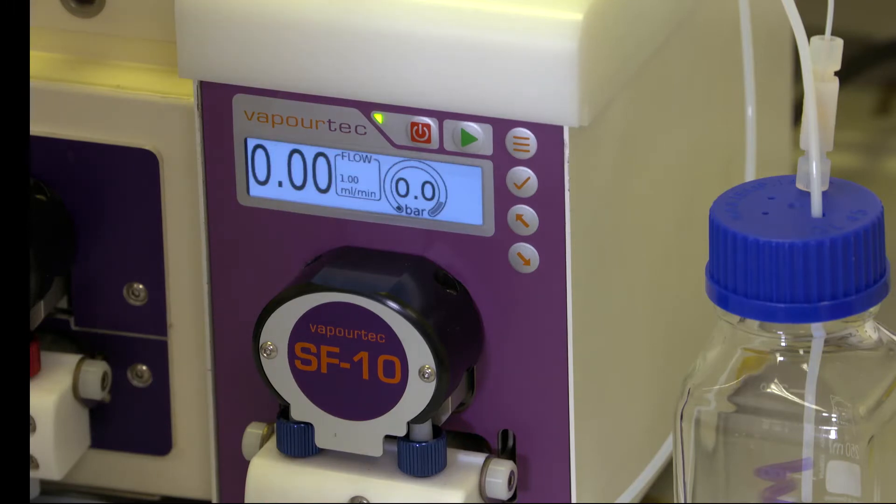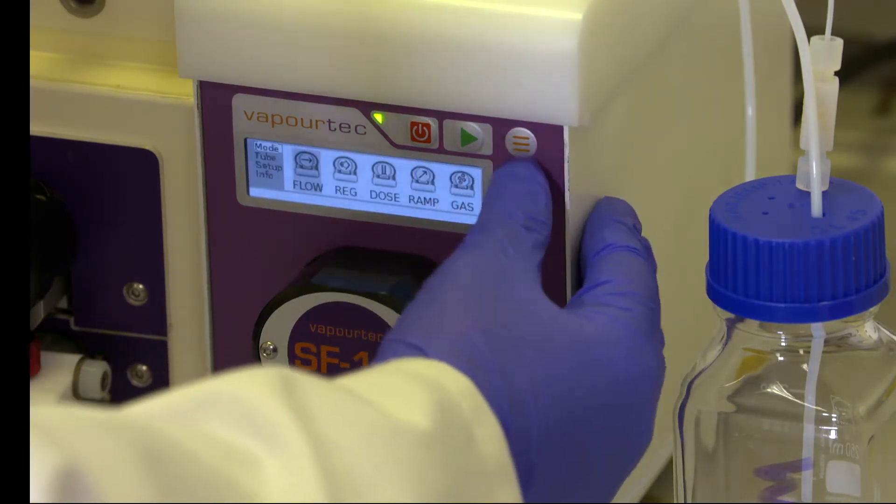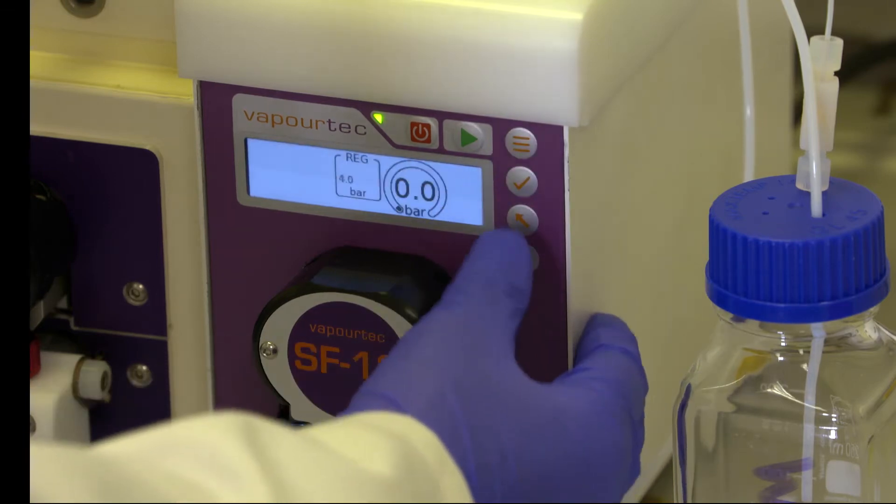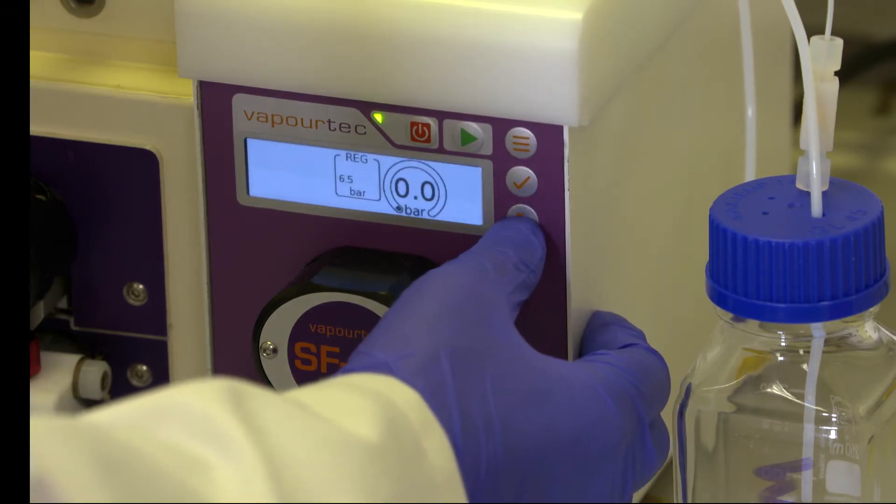To use the SF10 as a back pressure regulator, first I need to put it into regulation mode and then I need to set the pressure that I want to operate at.